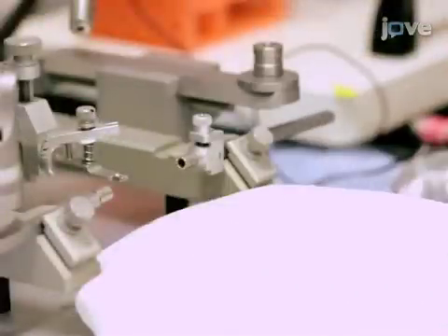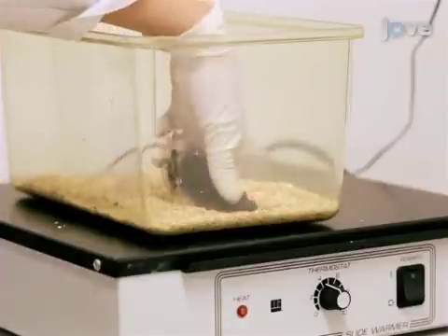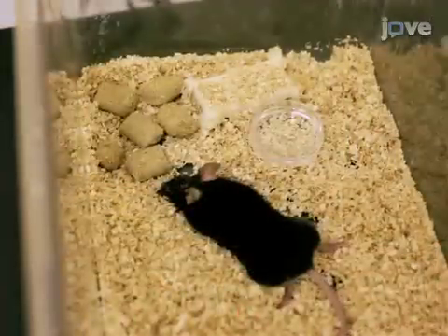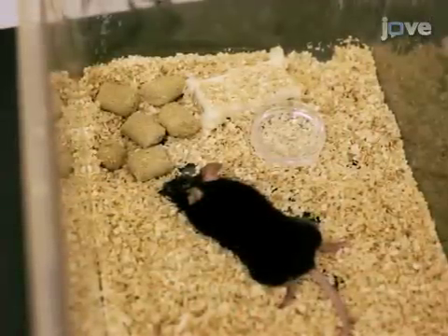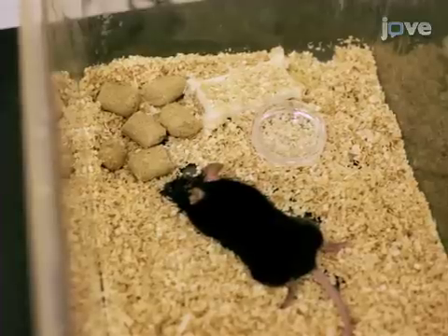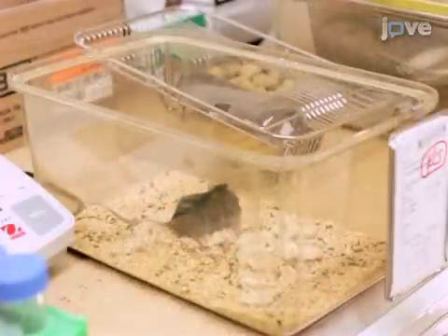Remove the mouse from the stereotax and place it in a warmed cage on a heat block to recover for 45 minutes to an hour. Let the mouse recover for at least 10 days to allow for maximal Cre activation. Give the animal water and softened food and buprenorphine twice daily if necessary.